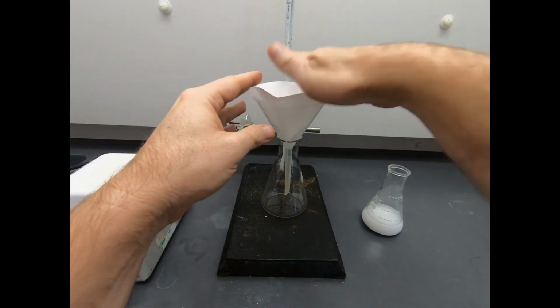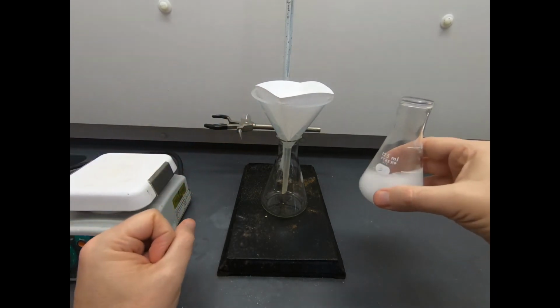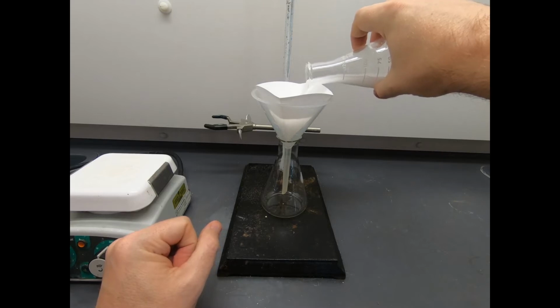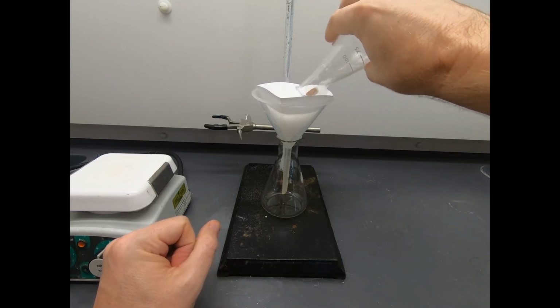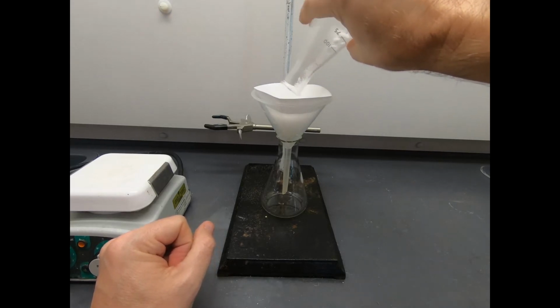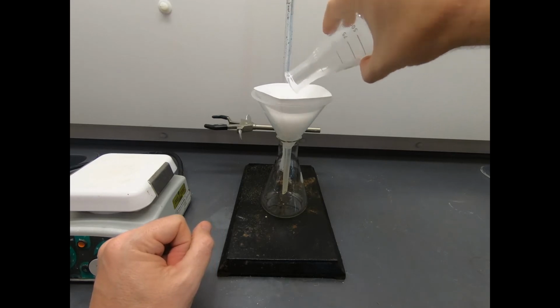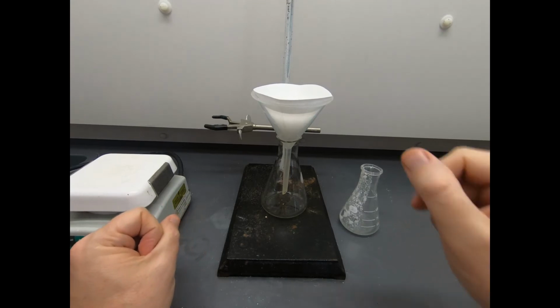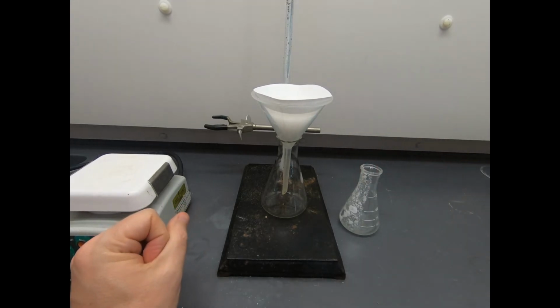Now isopropanol is a pretty thick, pretty viscous solvent, so this is not going to filter in just 2 seconds. Great. Okay, we are dripping through. Now, we are doing a gravity filtration. This is not a suction filtration.